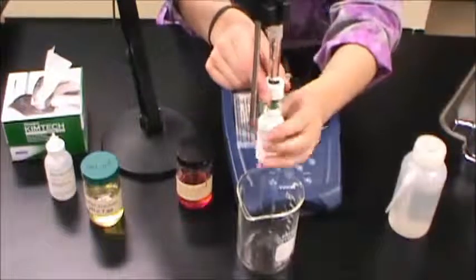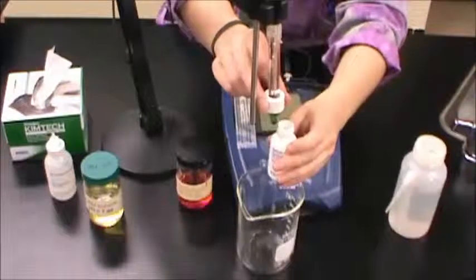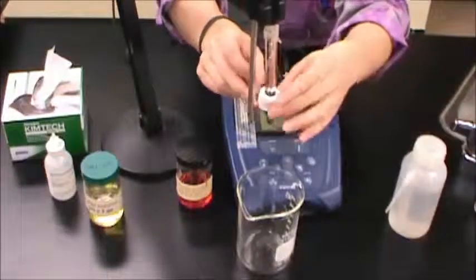Remove the bottle of electrode storage solution from the end of the pH probe and rinse both probes well with deionized water, then blot them dry with a Kim wipe.